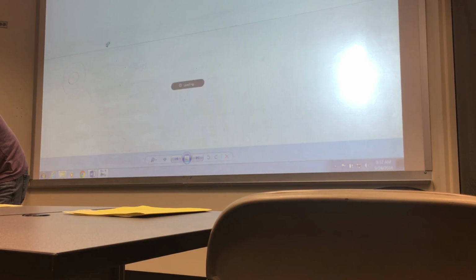I'll pick 74. All right. First person that asks a question I like, that is the question. Don't all speak at once. What's the main type of fiber there? Now that's going to be plural in this case. Fibers. So what are the 2 predominant fibers found here? Collagen fibers and elastic fibers.